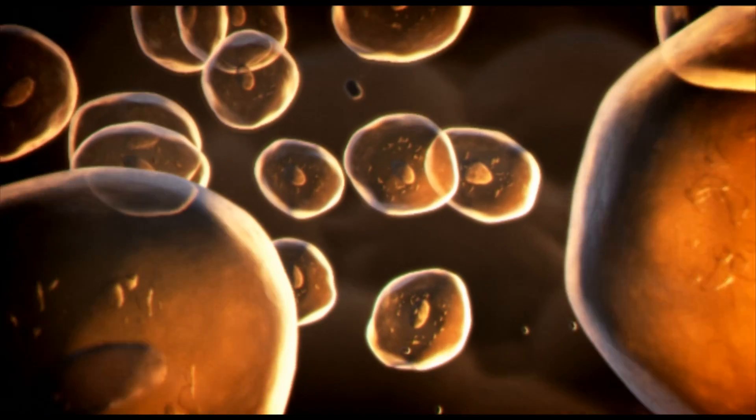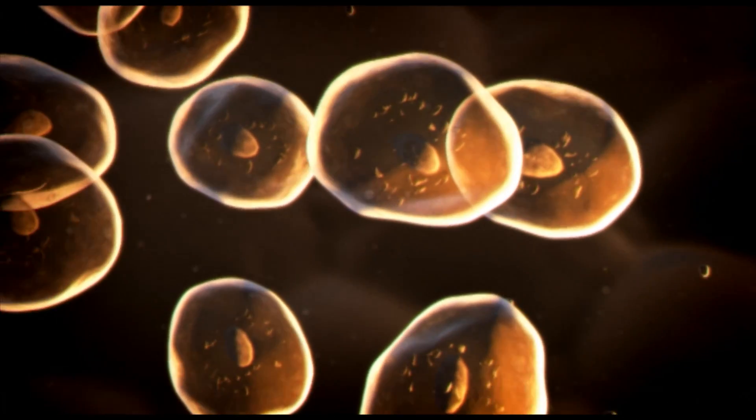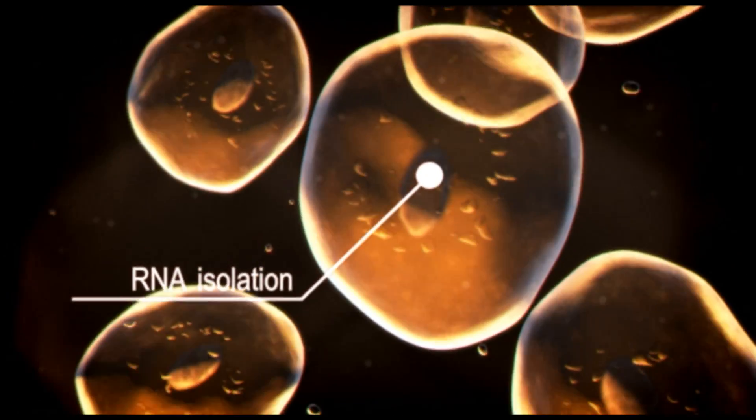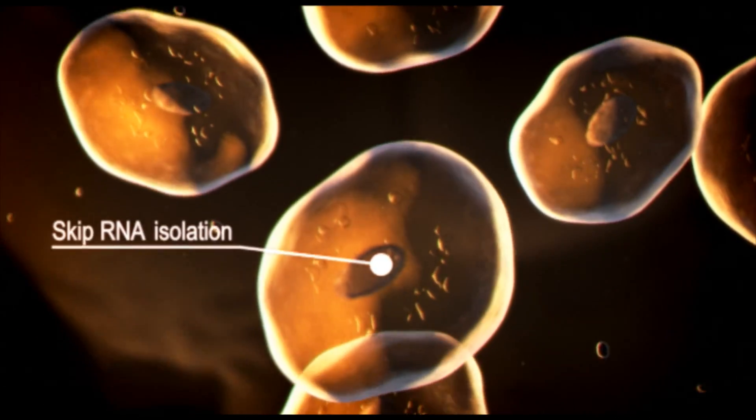Traditionally, the first step in real-time PCR is to isolate the RNA. This isolation step can require significant time and involve multiple handling steps, and a risk of sample loss.